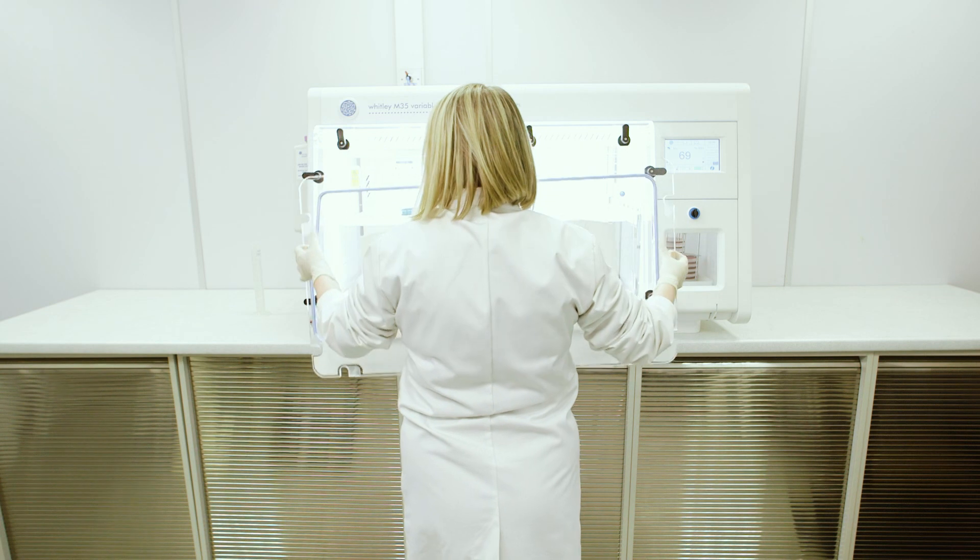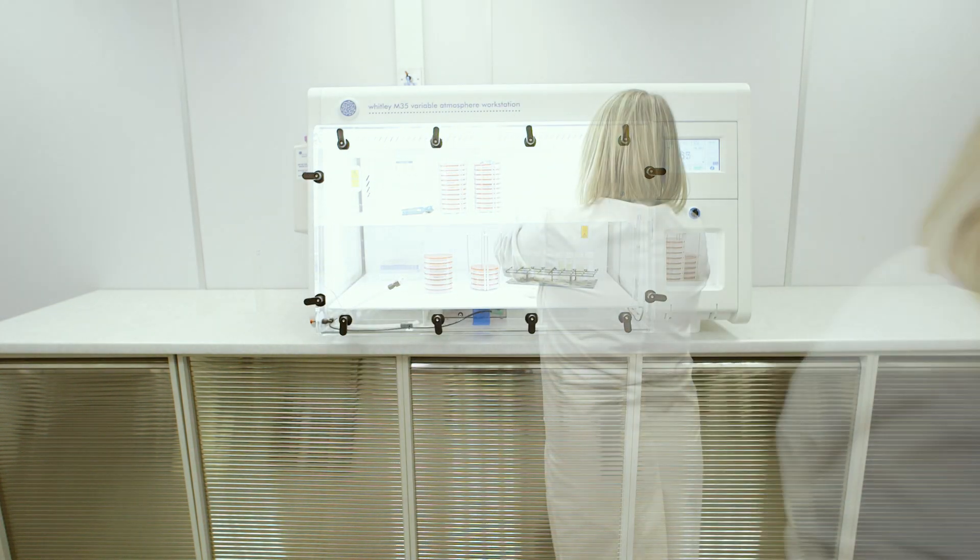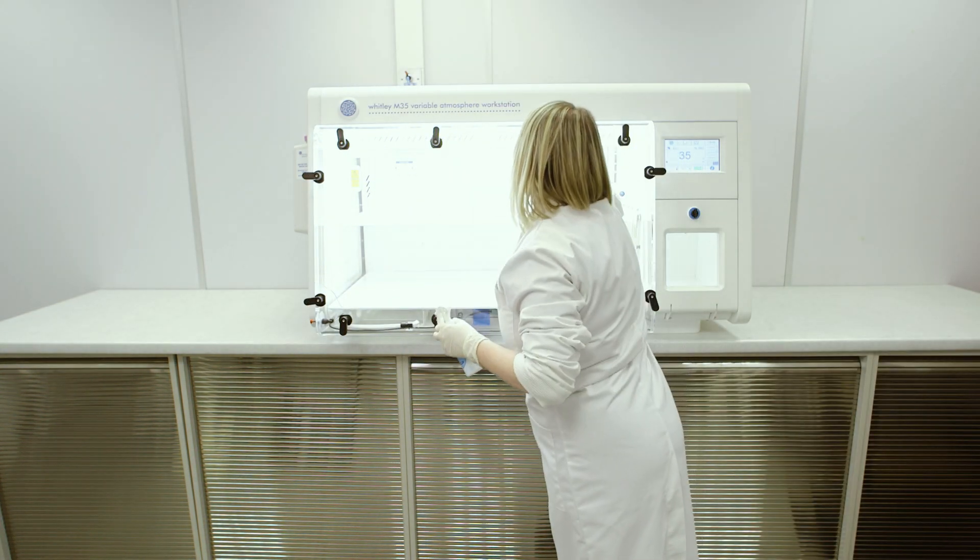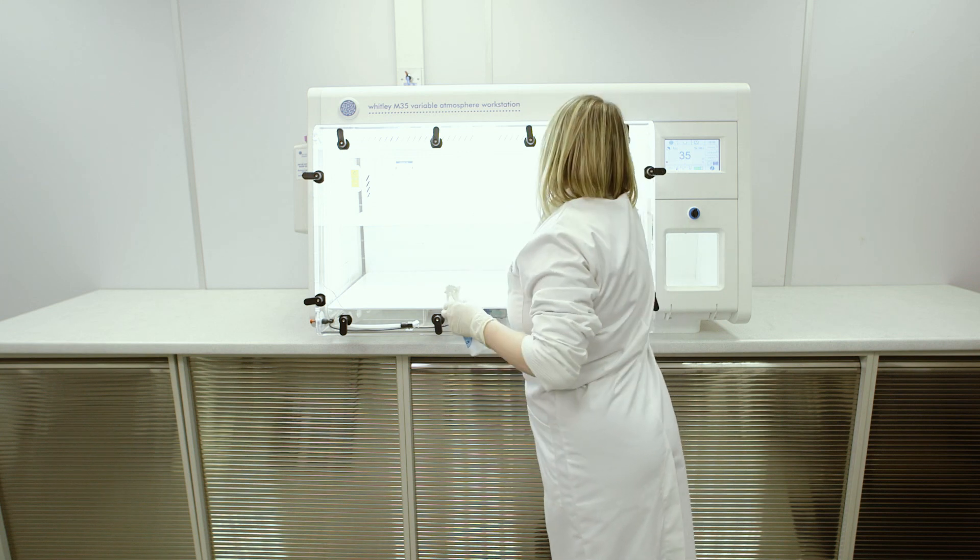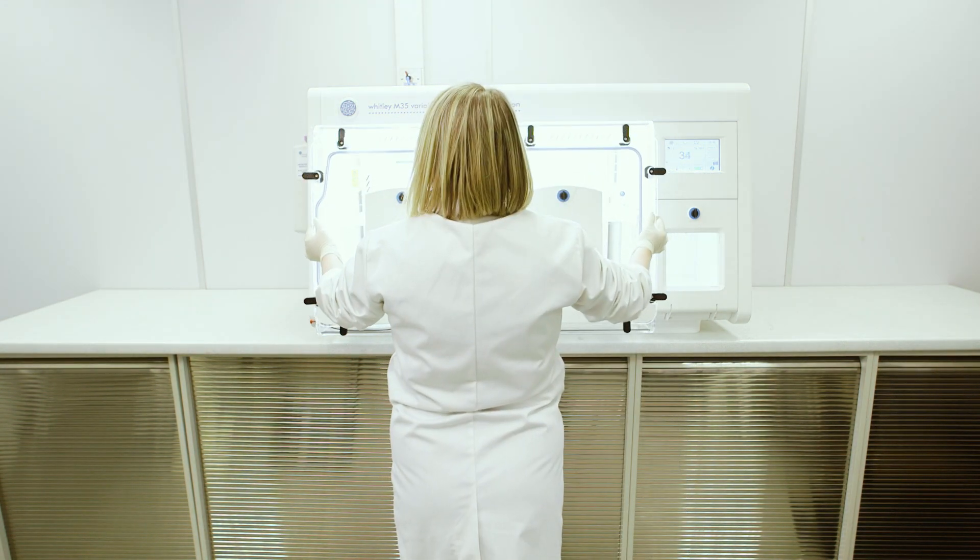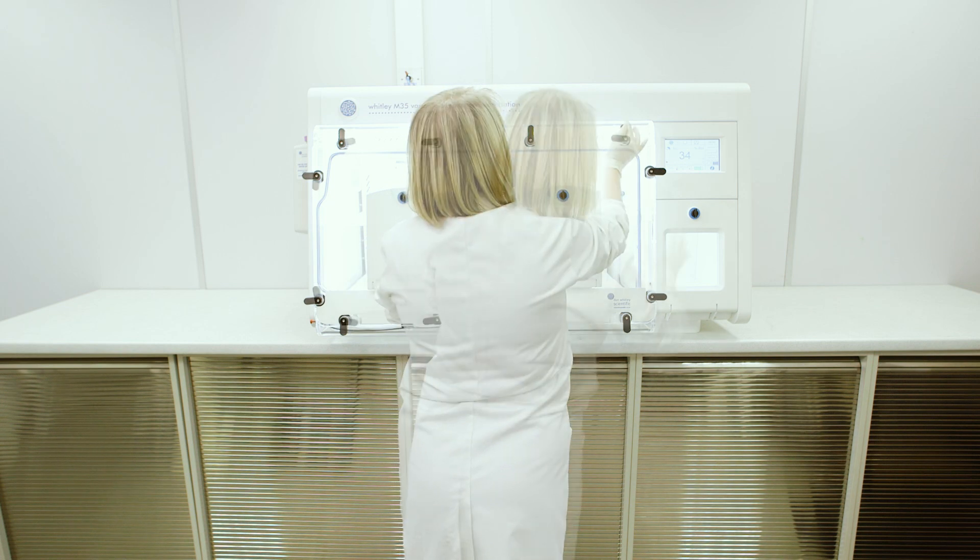Many Whitley microaerobic workstations can be fitted with a removable front. This enables easy access to deep clean the interior and allows the introduction of larger pieces of equipment or samples in bulk.